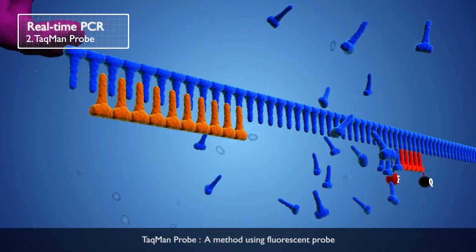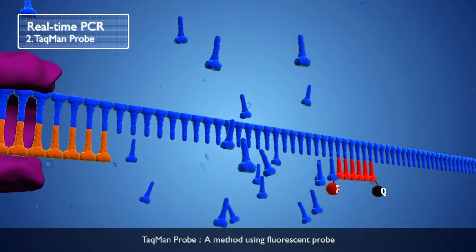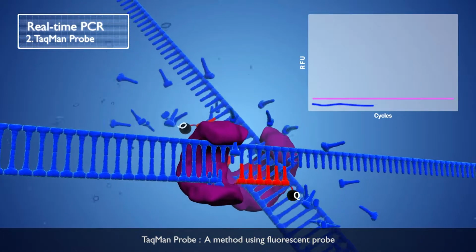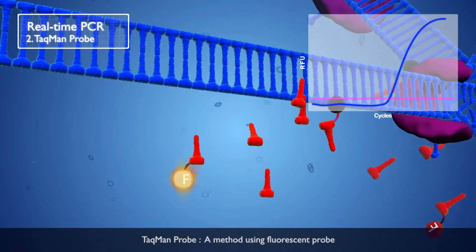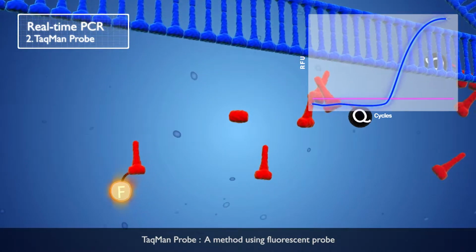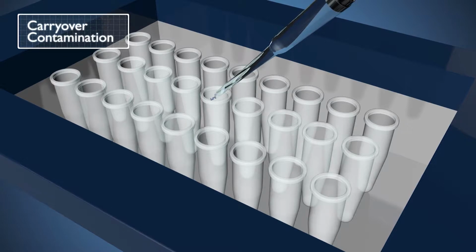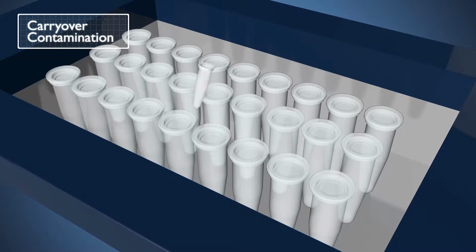Fluorescence probe is a high-specificity method which precisely detects target DNA containing sequence complementary to the probe. The probe is an oligonucleotide with a fluorescent reporter and quencher attached to its respective ends, and it will emit fluorescence as it is broken down by the 5' to 3' exonuclease activity of DNA polymerase during DNA amplification. Using multiple probes with fluorescent dyes of different colors, we can monitor multiple targets in one tube.